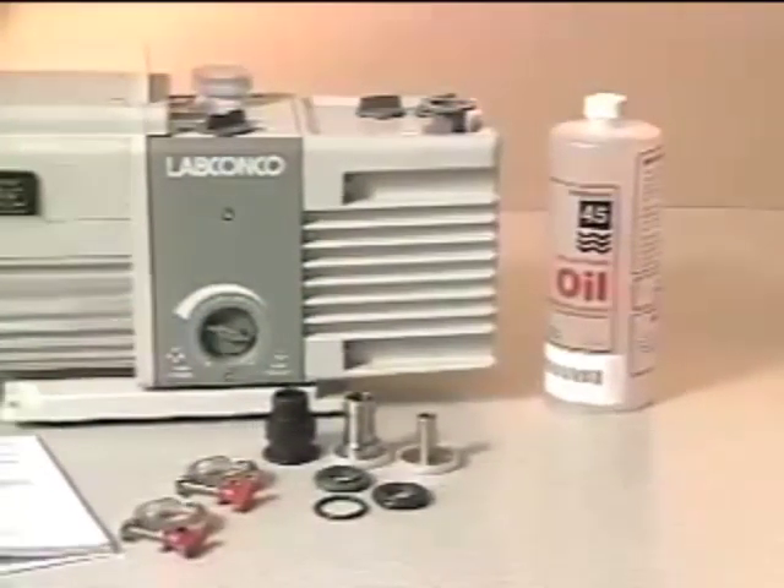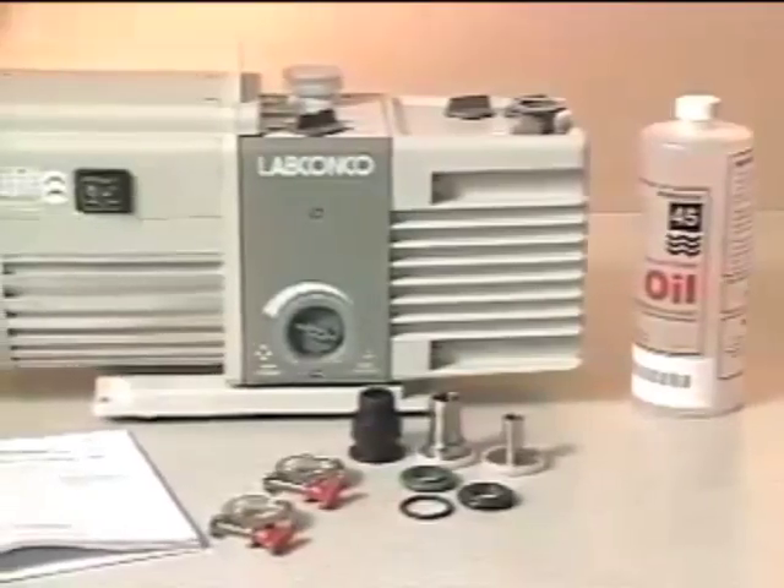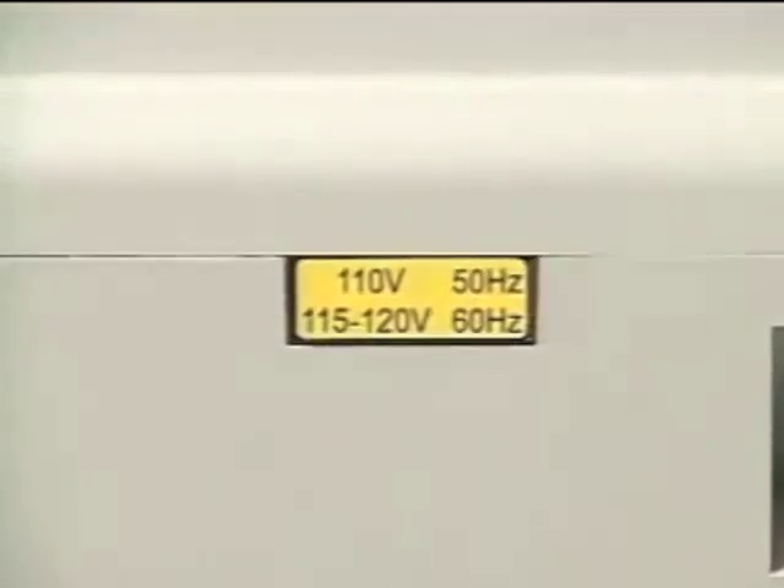The vacuum pump comes with several components and accessories, including a 1 liter container of vacuum oil. Be sure the voltage of the vacuum pump is compatible with your freeze-dry system.